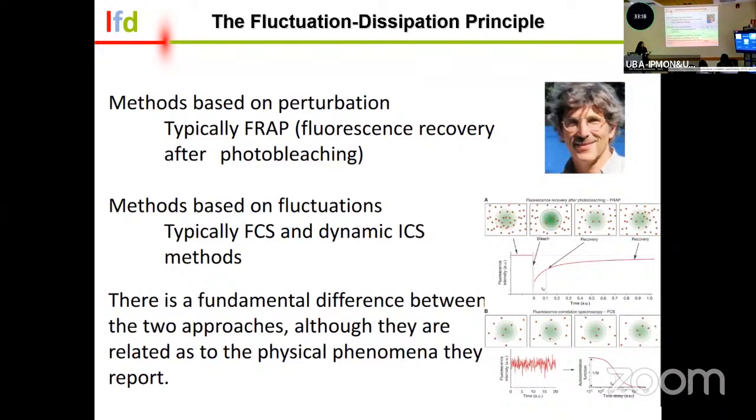Now, typically, scientists and biologists can use another type of method to measure this. They can use something called fluorescence recovery after photobleaching. And you can use a microscope, and here's the actual idea behind this. This was developed by Dan Axelrod, who I'm showing in this picture. And as a function of time, if we bleach a given spot, completely destroying the molecule, bleaching means those molecules are gone. They're no longer going to emit any photons.